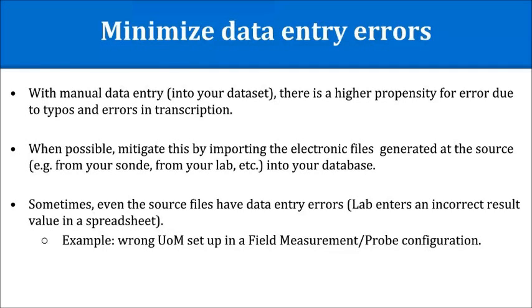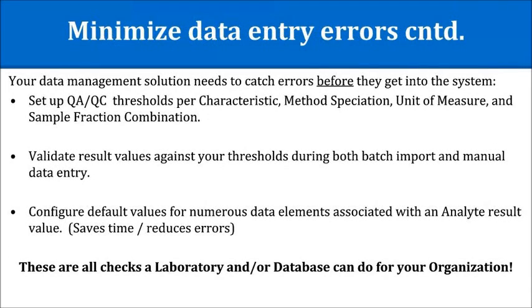Okay, another thing we would like to stress is QA/QC prior to then getting your data into WQX and Storet. So our data management approach is that we are assuming that you have performed all the QA/QC prior to submitting your data to Storet via WQX. So we'd like to give you some advice on how to QA/QC your data prior to getting that in.